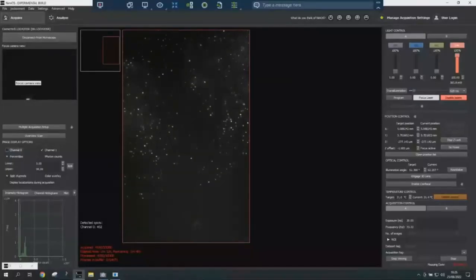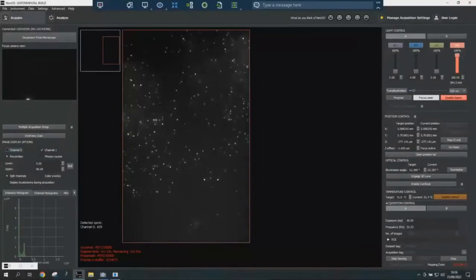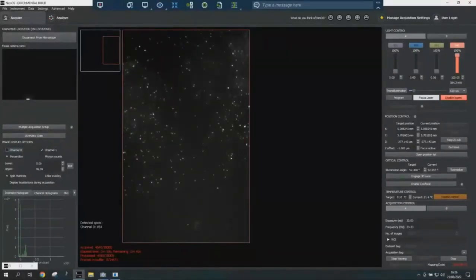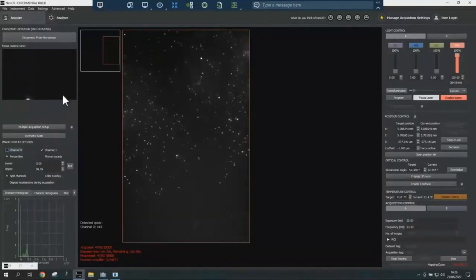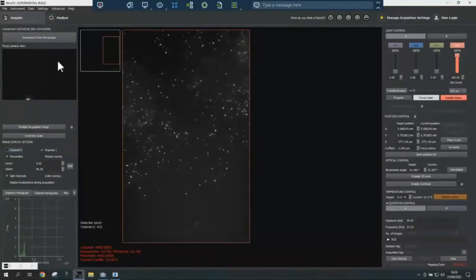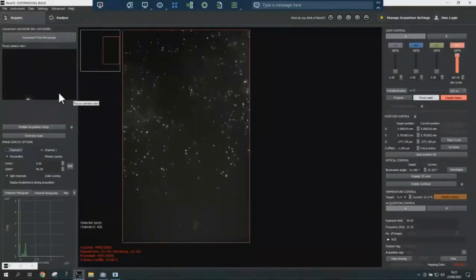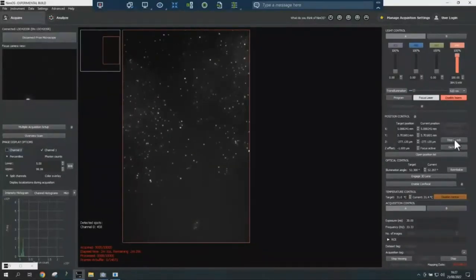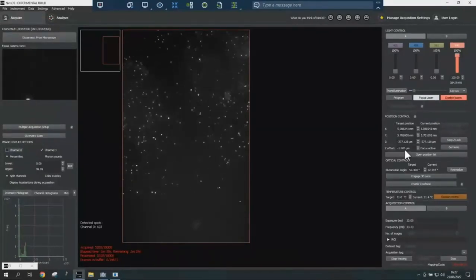So this is important because if you have transparent samples or samples that can be complicated to focus, this is just a nice system. Moreover, this also allows us to lock the Z-plane. We just click here, Z-lock, and it will stay steady for the whole acquisition.